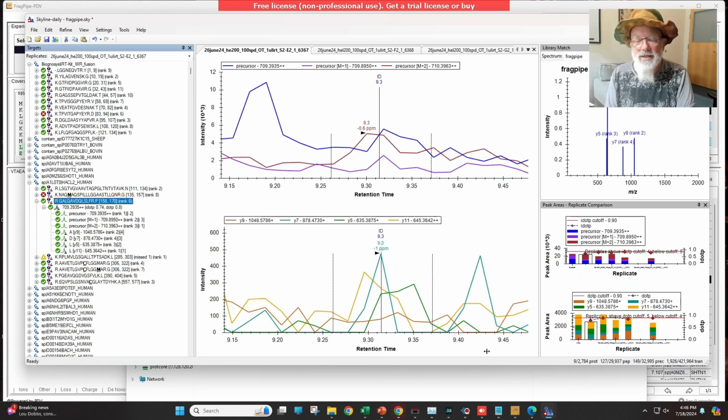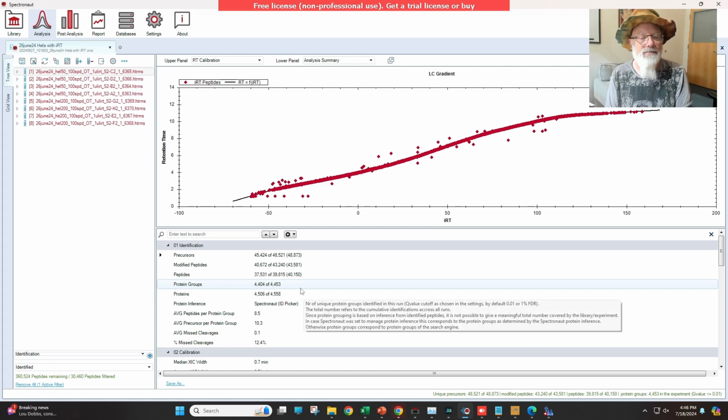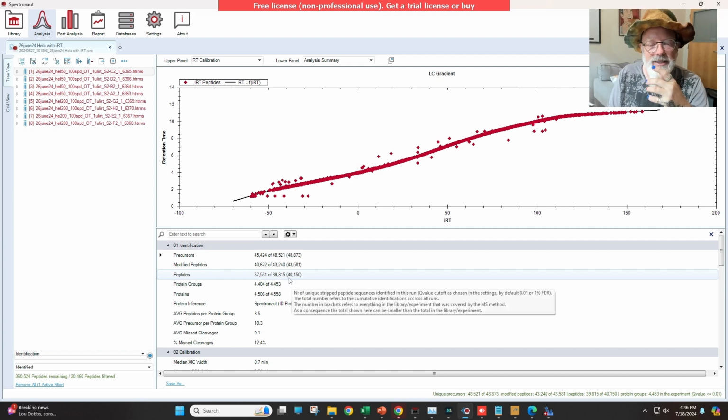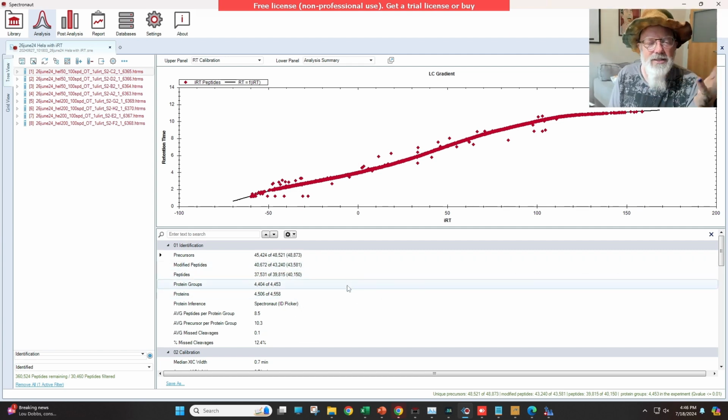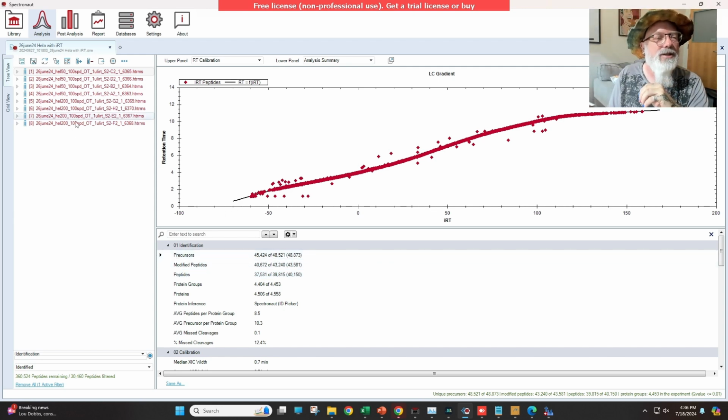All right, so let's see what Spectronaut showed from the same data set. And I have that here. This is the same data set we searched with FragPipe that we searched with Spectronaut. You can see, right away the number of IDs is almost doubled. So FragPipe implementation of DIA-NN, the way it does diaTracer and uses FragPipe and gets pseudo MS2 spectra, identified about 2,800 protein groups. You could see that Spectronaut identified 4,400, so almost, not double, but close. Why is that? I have some suspicions, but I don't know.